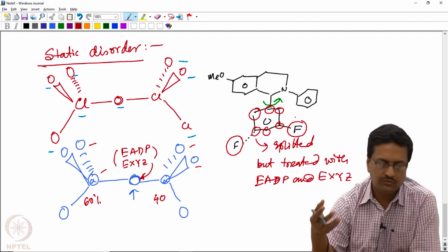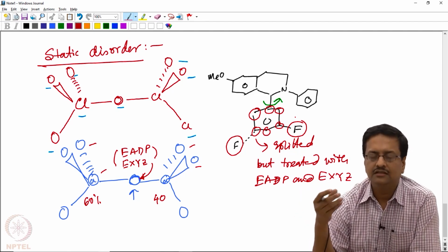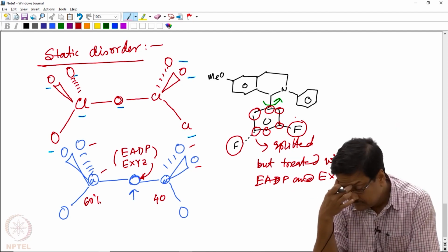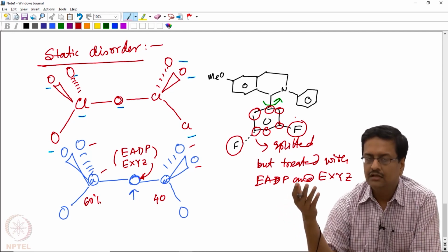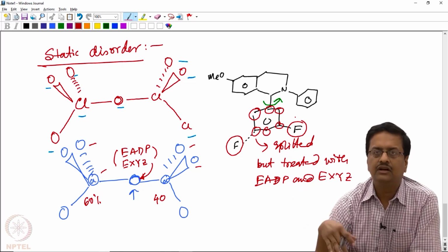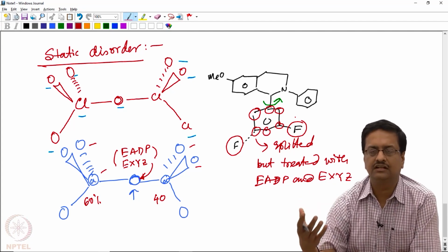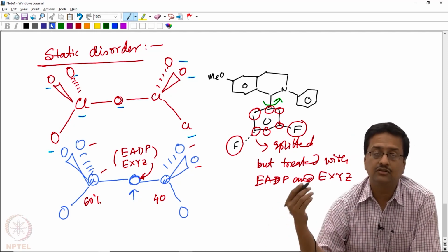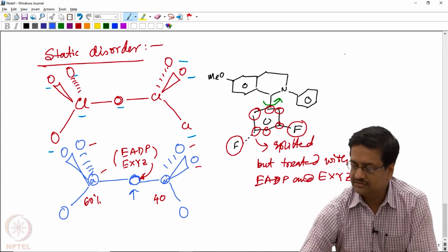They will have their own atomic coordinates, which should be defined separately using the fvar command, that is the free variable command, and doing it in +21 and -21. In case in one particular crystal structure you have more than one group of atoms having different types of disorder, then the thermal parameters or the occupancy parameters that you encounter should have continuous numbers.